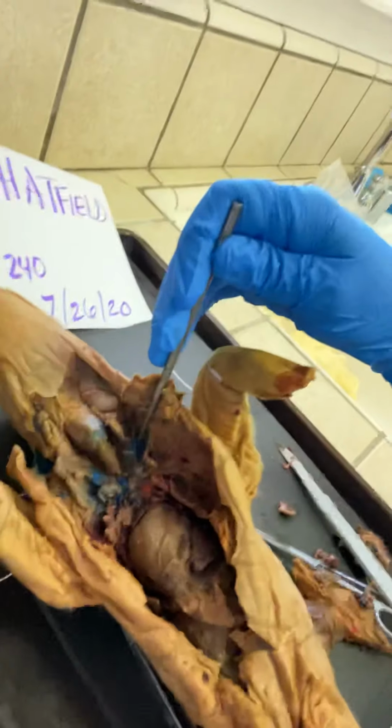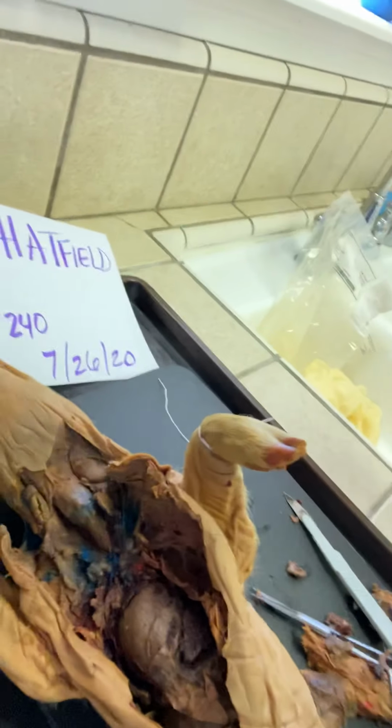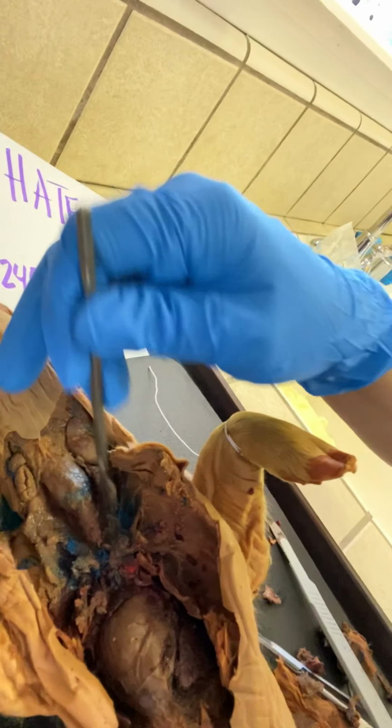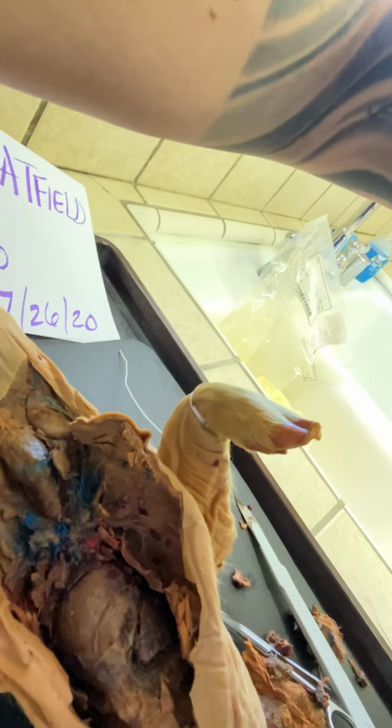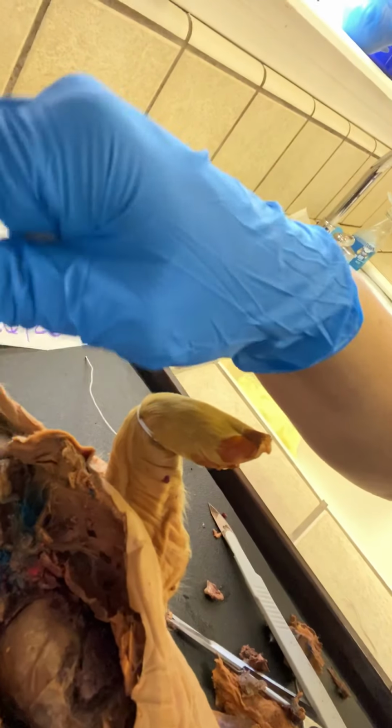Anyway, I'm going to start with the right and left carotid artery, and that you can find along here. It's actually closer to the trachea. It's here, the carotid artery.